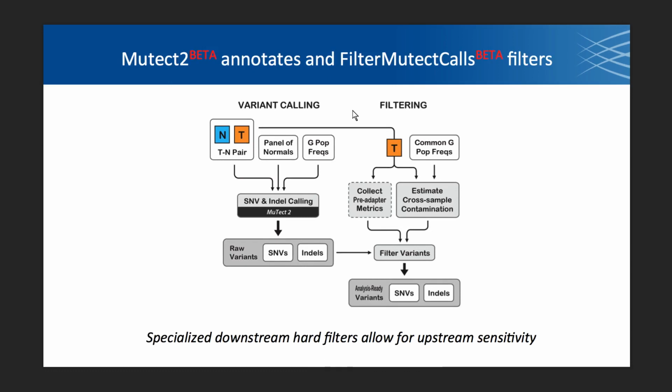So we've just finished Mutect2 calling. We have a VCF in hand. None of the variants or the mutations that are called have been filtered. So we're going into filtering now.